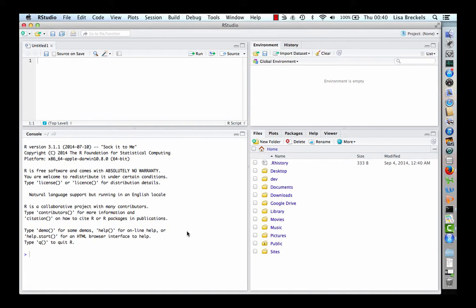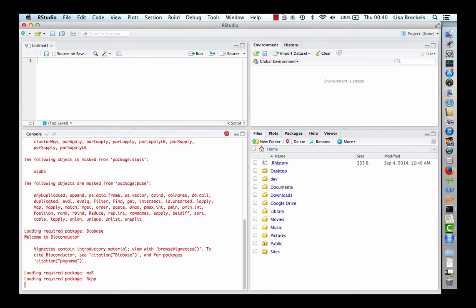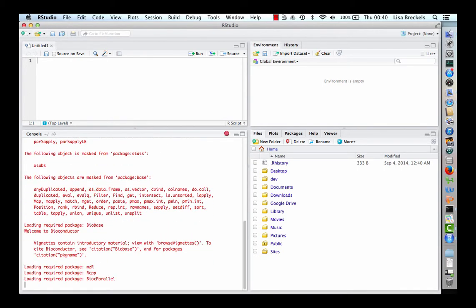Now we have the packages installed, we begin by loading them. Let us first load the ProLock data package. Type library ProLock data to load the package. This may take a few seconds.